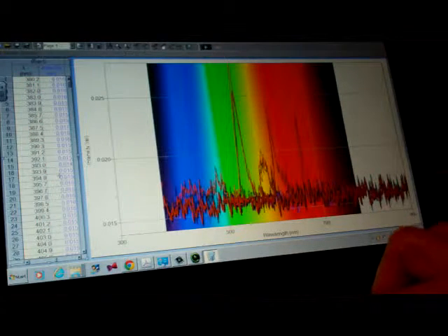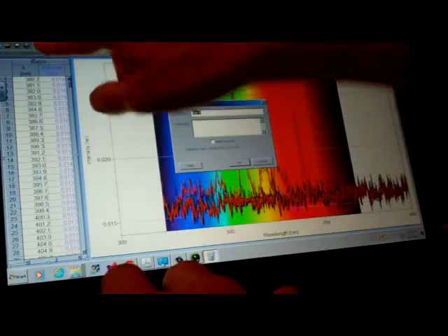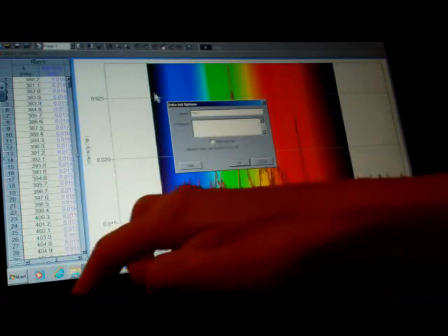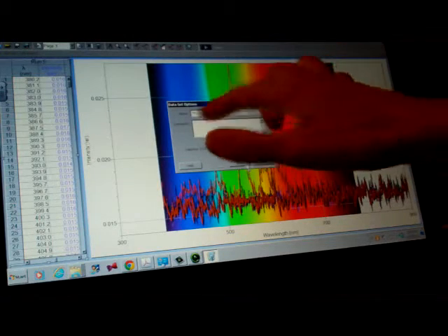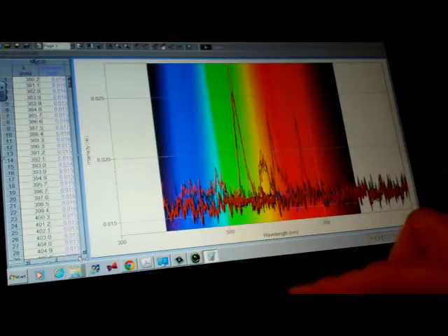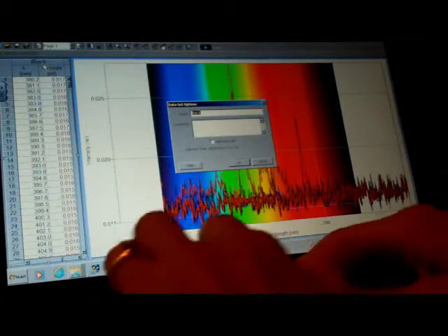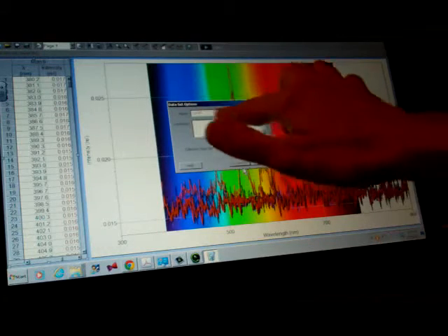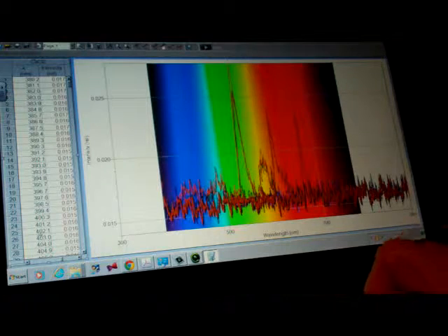Next, run 5 was, I arrowed over, double clicked on run 5. Now I'm typing magnesium chloride. We know the formula has a subscript of 2, not real easy to do that, so I just typed MgCl2, click OK. Arrowing over on the bottom again to run 6. Run 6 was calcium chloride, CaCl2, again subscript 2 in the data set options name box and clicking OK.